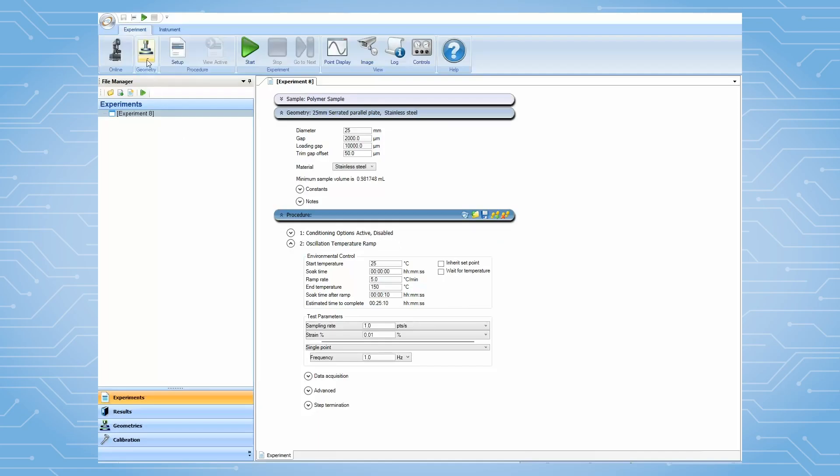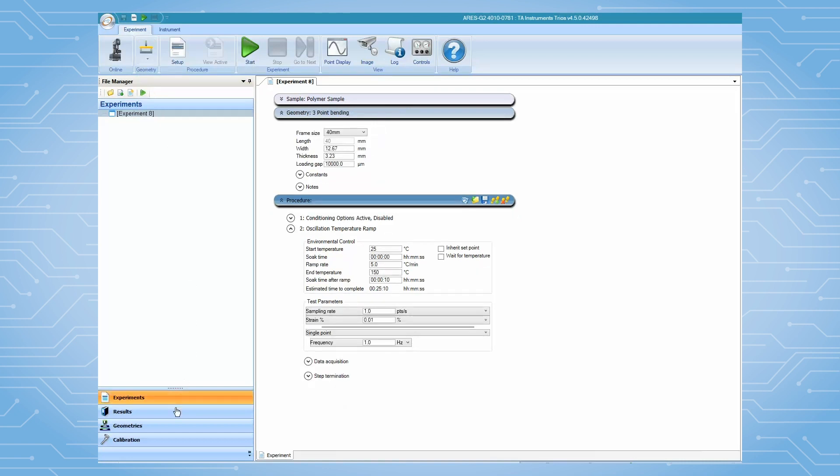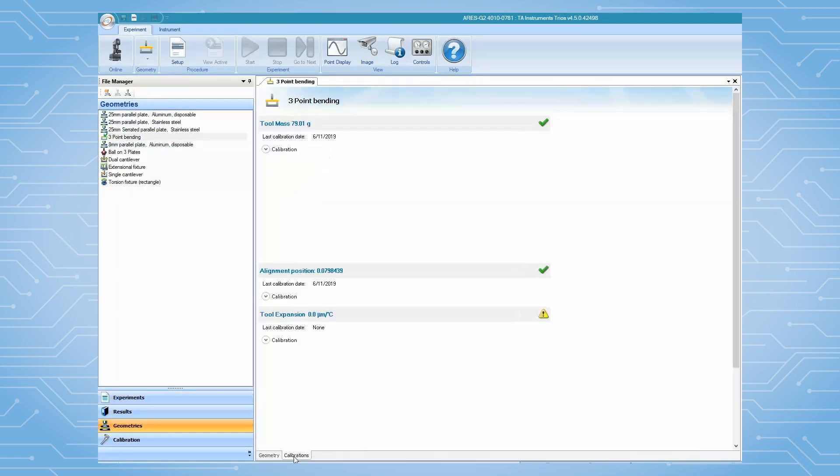From TRIO software, select the three-point bending from the geometry drop-down menu, then proceed to the clamp calibration.